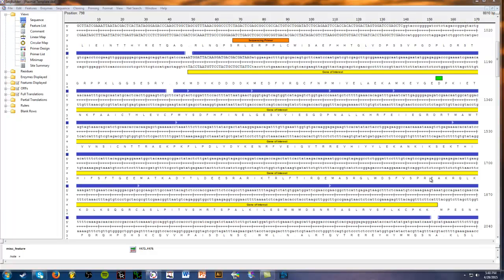Hello everyone, this is Scyther88, and today I'll be showing you how to check your sequencing data using a program called SeqMan, which is part of the laser gene suite.